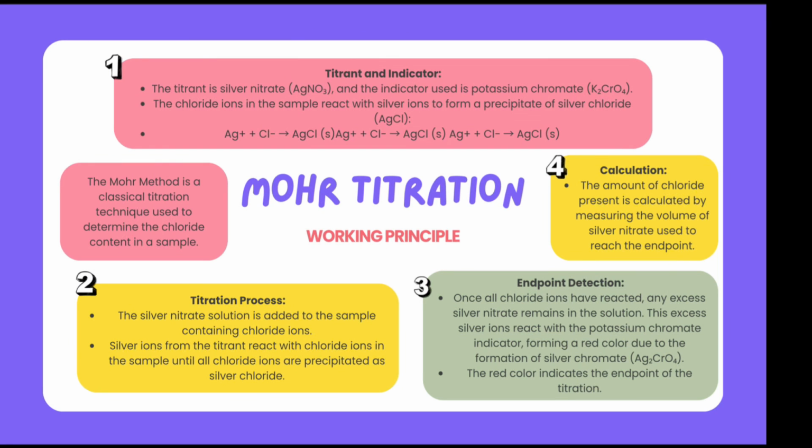For the titration process, we need to put our sample, which contains chloride, in the titration vessel, and a few drops of potassium chromate indicator must be added. The solution is yellow from chromate. Then, standardized AgNO3 is slowly added while stirring. The primary reaction forms a white precipitate. Silver chloride forms as a white solid and removes Ag+ from solution while chloride remains.